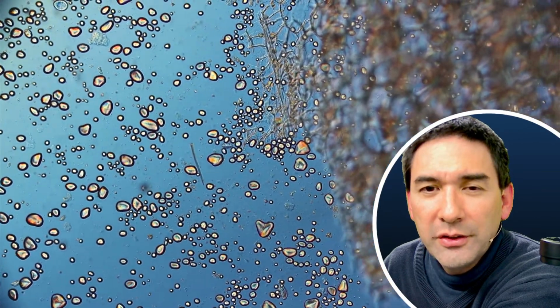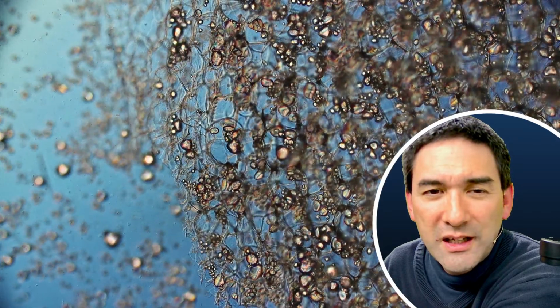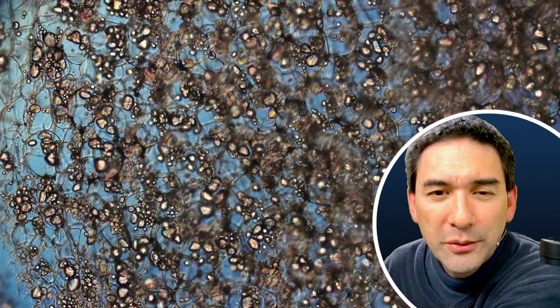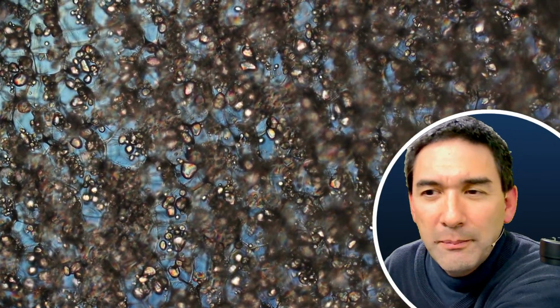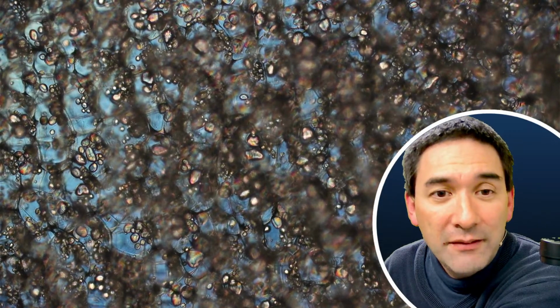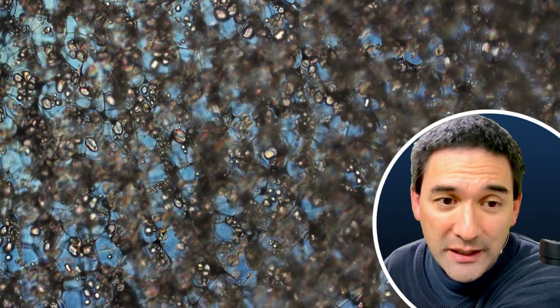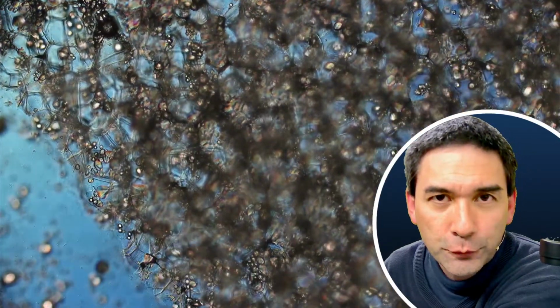So, over here, this is where the specimen starts. I have to focus again. You can see the round starch grains of the potato inside the cells. You need iodine. Yes, I have iodine, but I'm not going to use it because I am afraid.